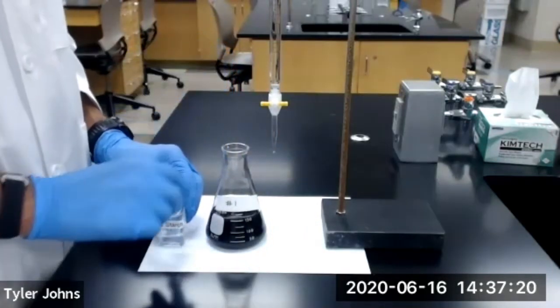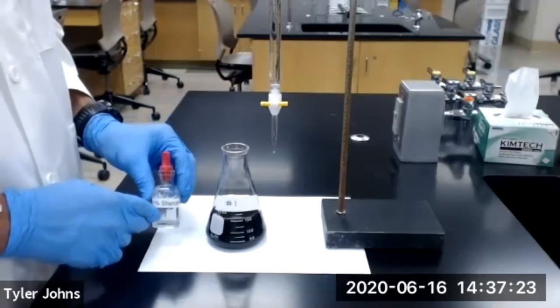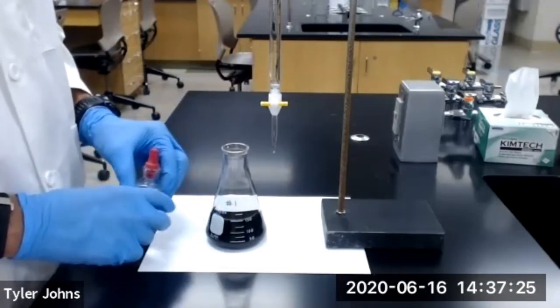Note our color change after the addition of the 1% starch solution. We now have a dark color.